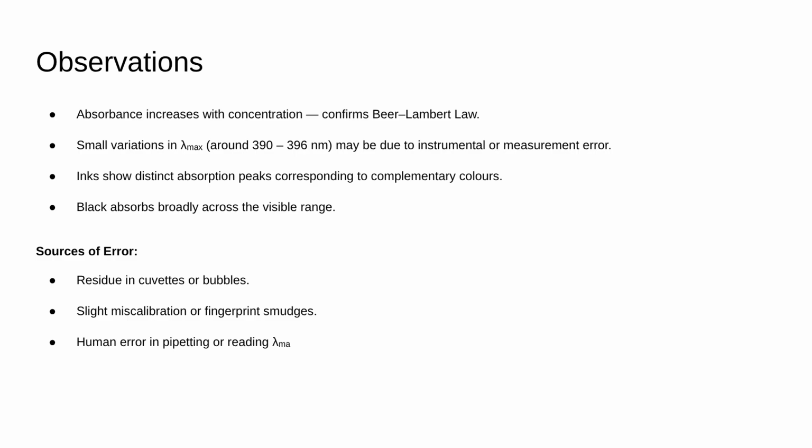And then the most obvious human error is using a pipette, or it could have also been a measuring cylinder. Using a pipette, it's never 100% accurate that you get the exact amount of solution that you actually need. There could always be error, even if it's plus or minus 0.5 of a centimeter cubed or whatever it was.